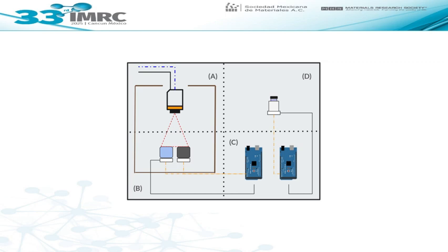In zone B, the sample or reference body stays at a constant temperature thanks to our electronic temperature control device located in zone C. And for the last, in zone D we have a thermal bed where we put our source of surfactant solution at the same temperature, or a very close temperature, to the analysis temperature of the sample.